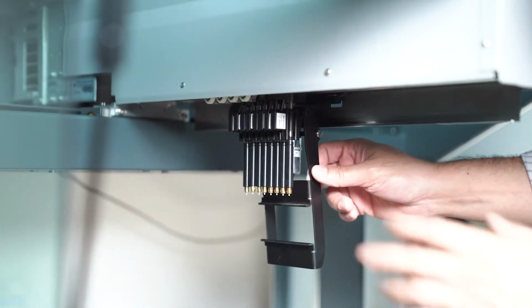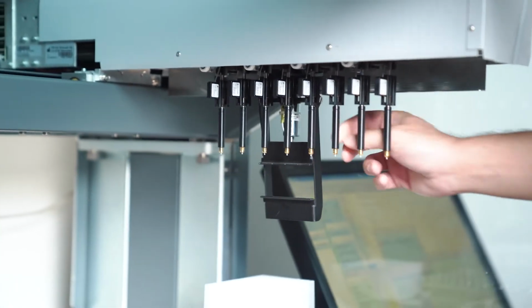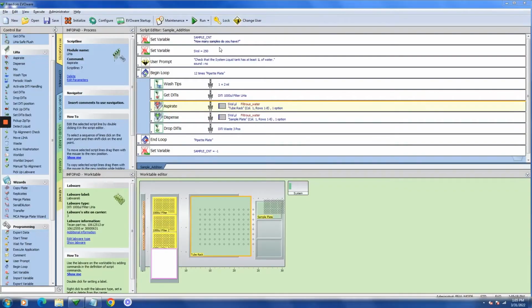The idea is it's gonna grab the tips, pick up the liquid, aspirate, and then dispense in here. So I'm gonna show you how to create that script on the Evo, and what to look out for. Let's go and let's look at the script. So this is the tube to plate script.